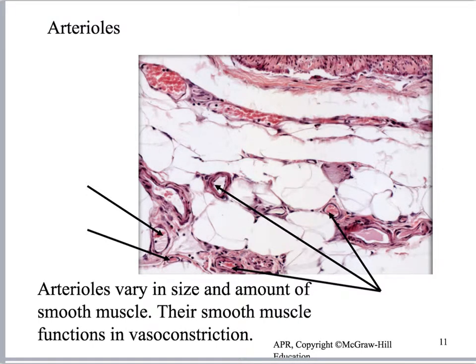When looking at many tissues and getting closer to the capillary beds, you'll start seeing arterioles cut transversely. They're basically round, with a hint of the tunica media. You can't see the tunica interna very well, but you can tell it's staining like simple squamous epithelium. With experience you start knowing that if you see this type of cut, it's most likely an arteriole.